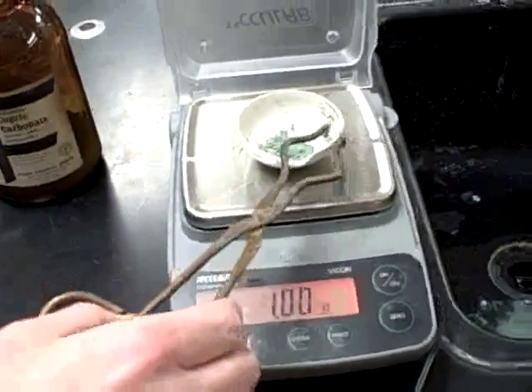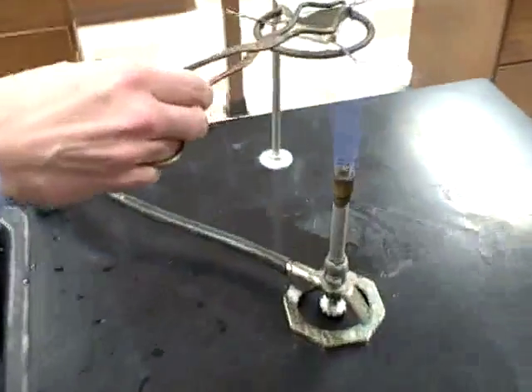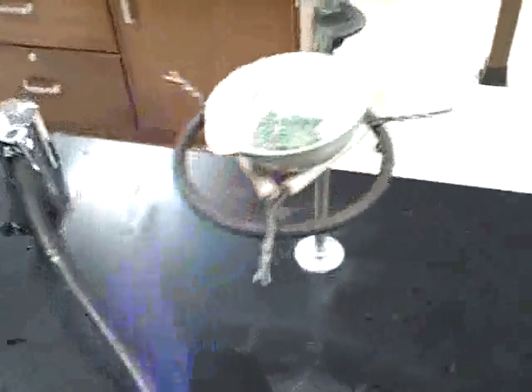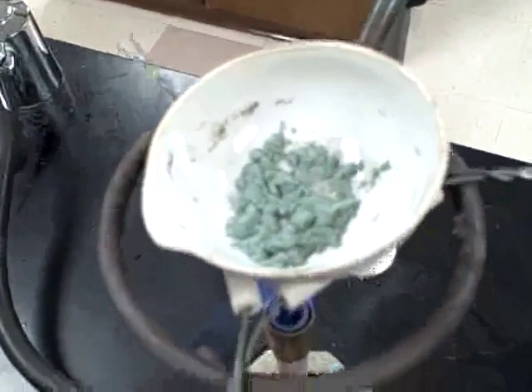We will now take our 1 gram of powder and place it over a Bunsen burner. The evaporating dish will sit on a clay triangle and we will heat it for several minutes.